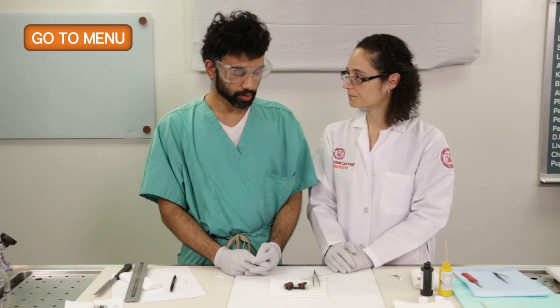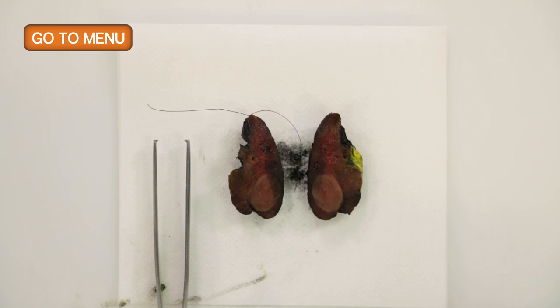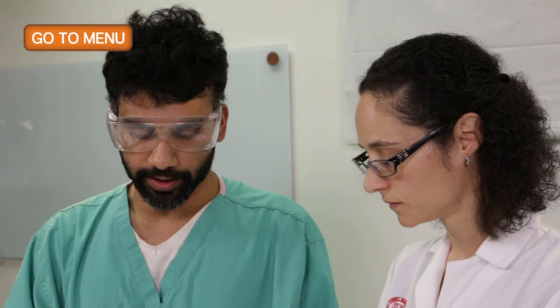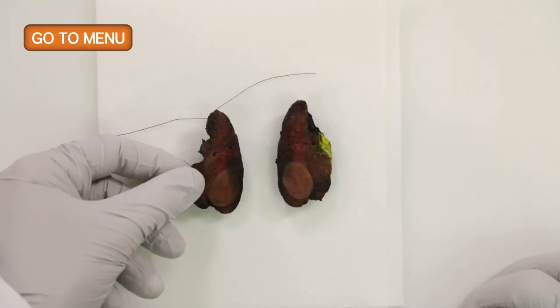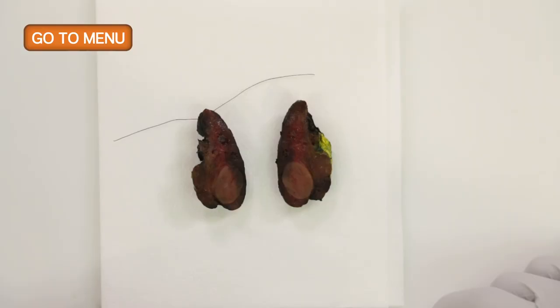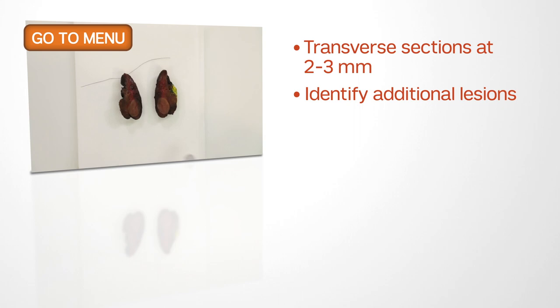Okay, so we've cut this coronally now. We've talked about the sections that we're going to submit, but have we completely sectioned this specimen yet? No, we're going to have to make additional transverse cuts. Correct, so once you do a coronal section, then you want to do transverse sections of each half of the lobe that you've cut. When I do the transverse sections, how thick should the sections be? It should be 2 to 3 millimeters in thickness because you don't want to miss any additional lesions that you may have. And that's a nice thickness. Okay, so I'll go ahead and start doing the sections on each one.